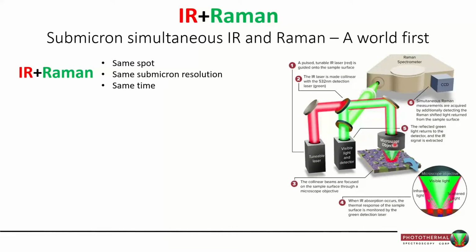But any of the Raman photons that have been generated, remember we're using a Raman grade probe beam here, so there's Raman scattering whether we like it or not, whether we want to use it or not, it's happening. So we use a dichroic filter to pick off only the Raman scattered photons and send them off to a Raman spectrometer from where we collect the Raman spectra, and all of the other photons go on for visible detection for the infrared spectral extraction. So it's actually an incredibly efficient means of collecting Raman and collecting infrared without compromising either of the two measurements.